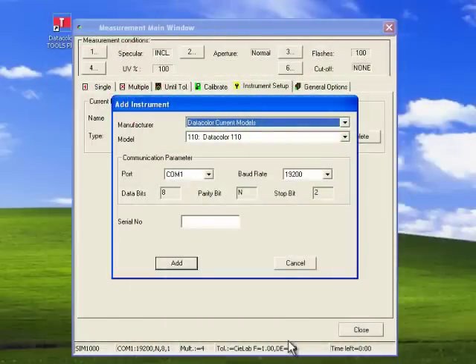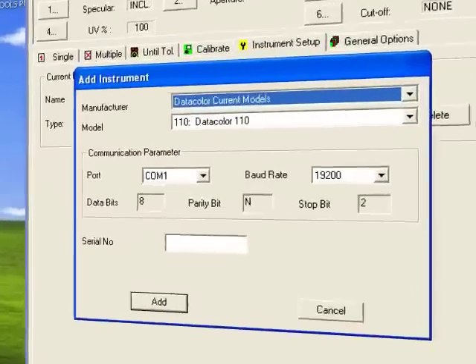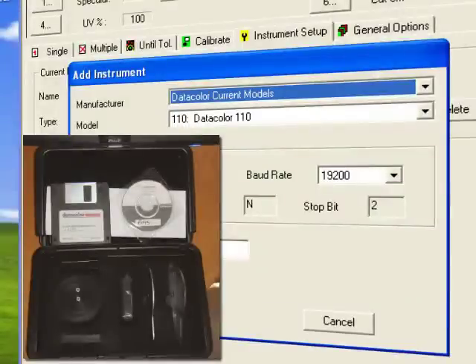The first time the user logs into the program, the system will show the Add Instrument window. Each instrument is accompanied by a black box that contains calibration standards, data, and apertures. These standards are unique to the instrument and are identified with the instrument's serial number.